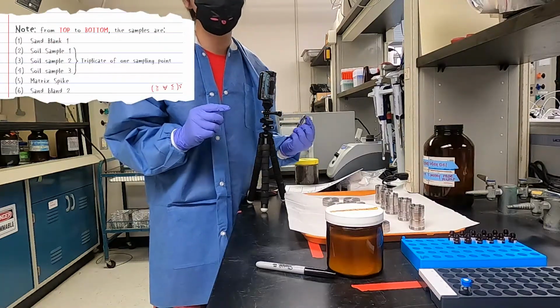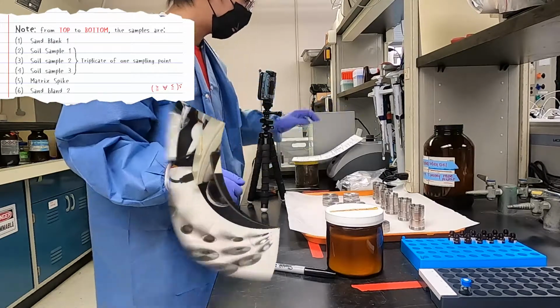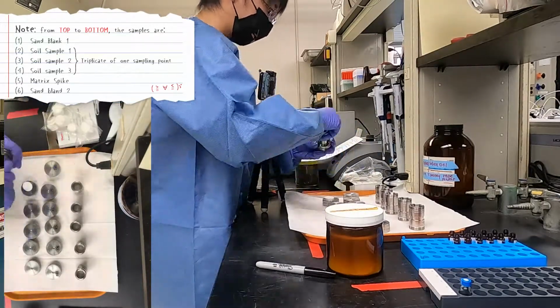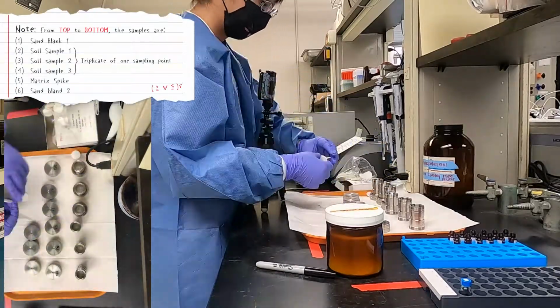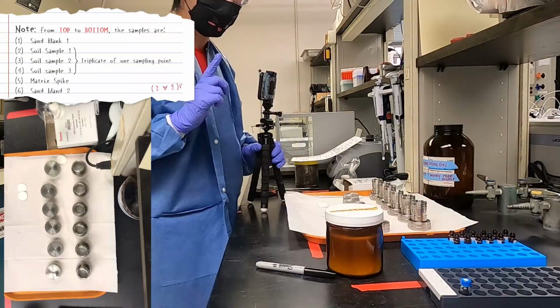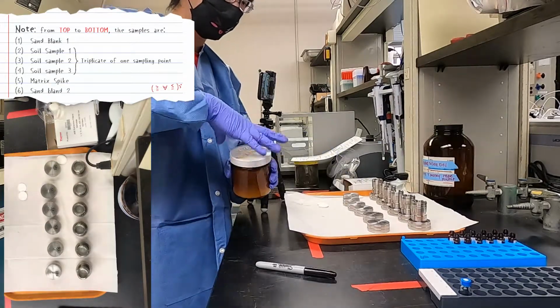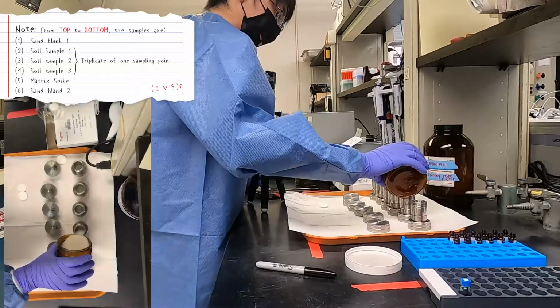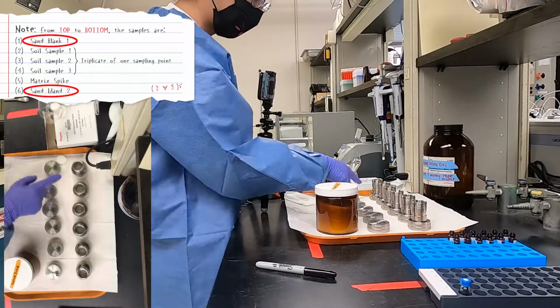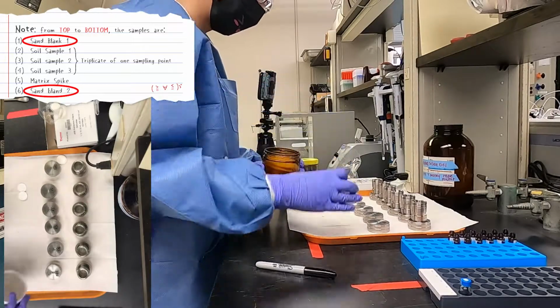So now I am going to prepare the samples, 2 blanks and 1 matrix spike. The first step is to put the filter into each of the columns. And then we are going to weigh 1 gram of soil sample and fill it into each column. And then we fill up with some of the sand. For the first one and this one, they are both sand blanks, so we can fill them up with sand only.